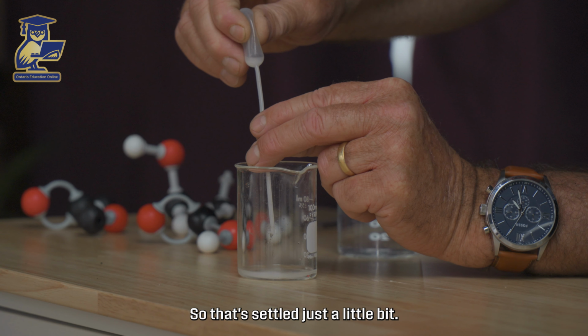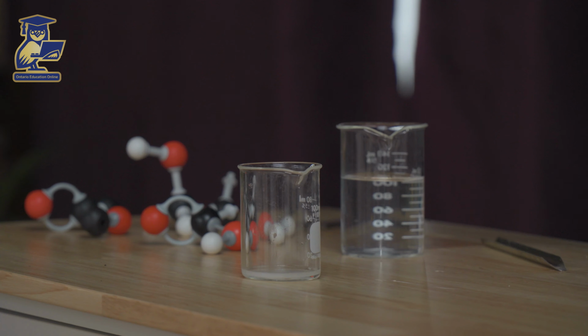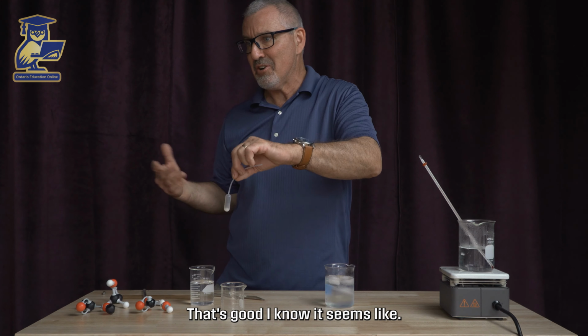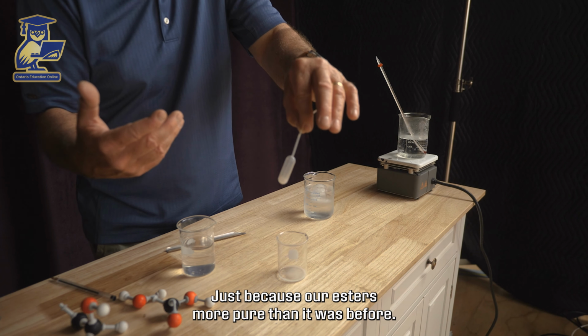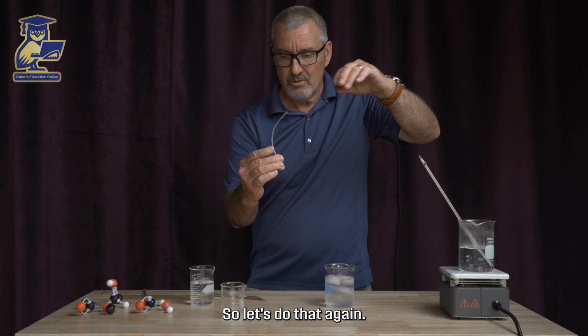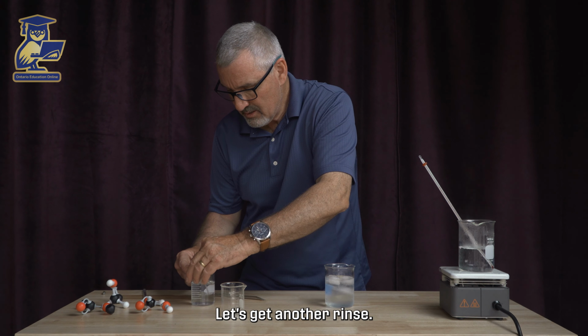So that's settled just a little bit. I just want to get just that top layer. All right, so we have a little bit less. That's good. I know it seems like, oh, man, we lost some. That's fine, just because our ester's more pure than it was before. All right, so let's do that again. Let's get another rinse.